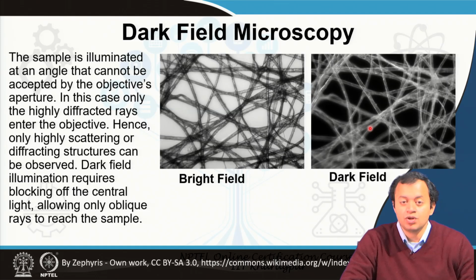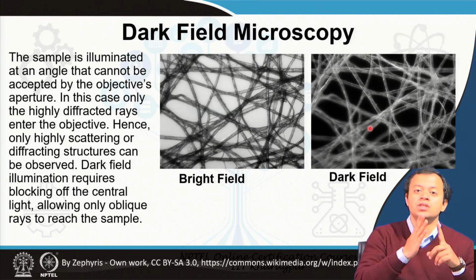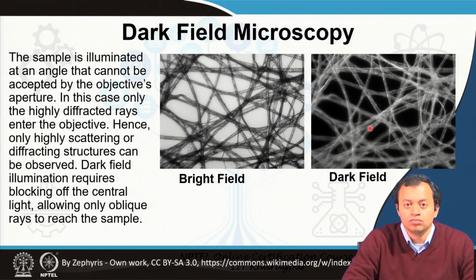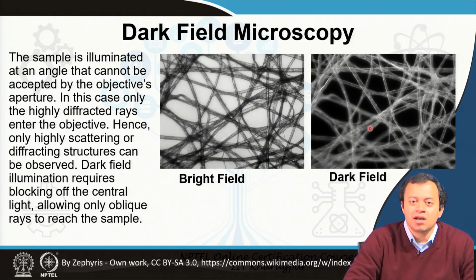Obviously, it has its own disadvantages. When you are blocking some amount of light, obviously the area is becoming darker, right. So, it is like putting a curtain in front of your window. Why? To block some of the light, but then if it becomes too dark, you have to switch on external light to see, right. So, it is something of a similar principle.